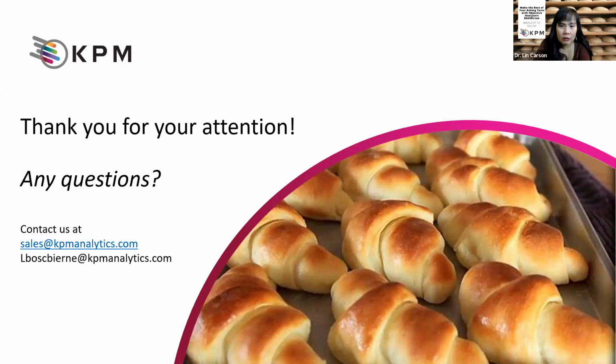And as you can see, a lot of the fermentation studies are showing that gas production has other variables to deal with other than the yeast quality and the yeast amount. So by understanding the RheoF4 data, you would be able to tailor your process to your final product. And that's always key. My prediction is that in the next couple of years, with everybody working on generative AI, we would eventually see some of that IP spill over into food manufacturing. So hopefully by then you will be ready with all your data so that you could just put it into some form of a machine that will spit it out for you.